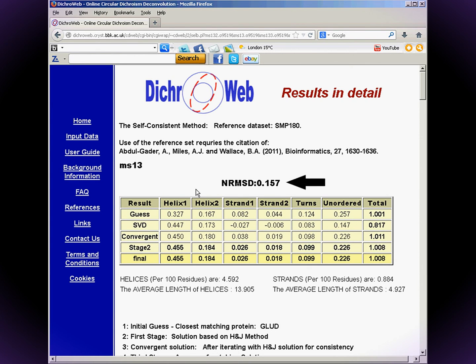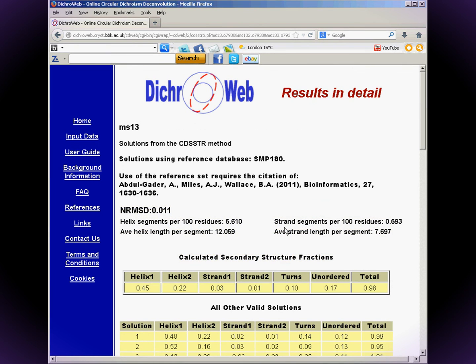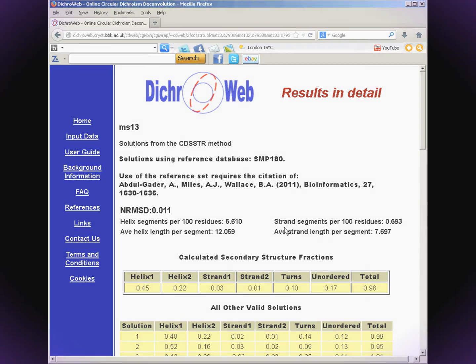Then use the CDSSTR program — you'll find that the NRMSD is always lower. This is a quirk inherent to the algorithms and doesn't necessarily mean that one gives a better result. Finally, average the results from all three.